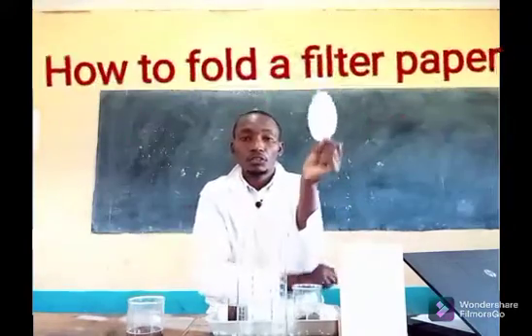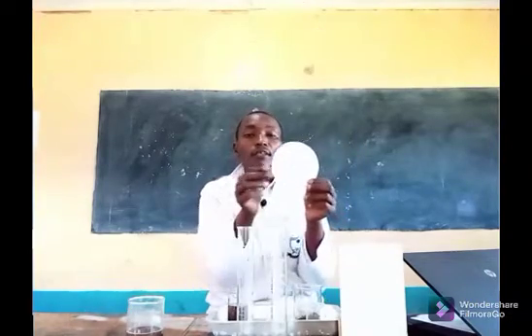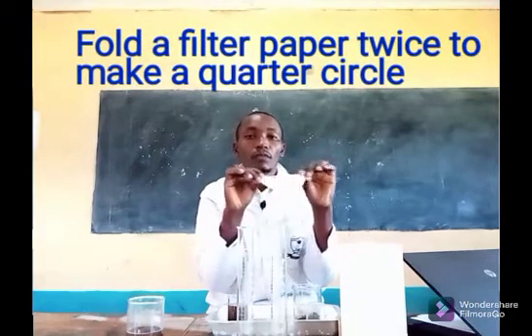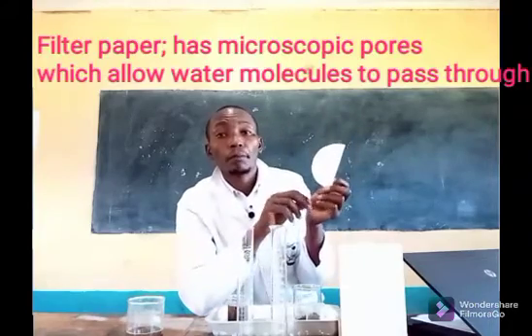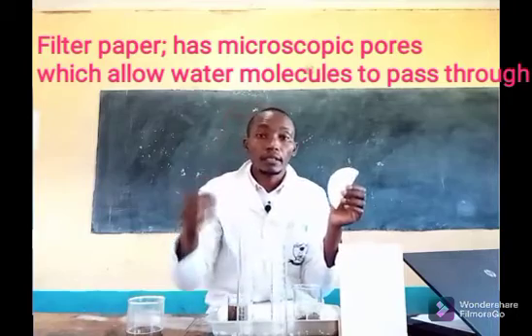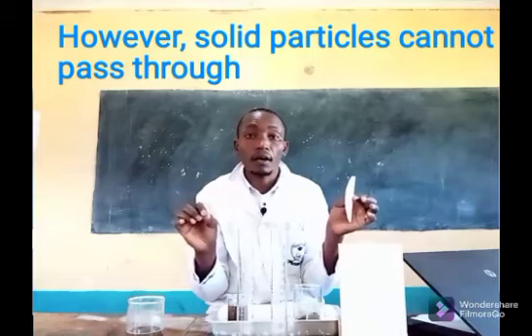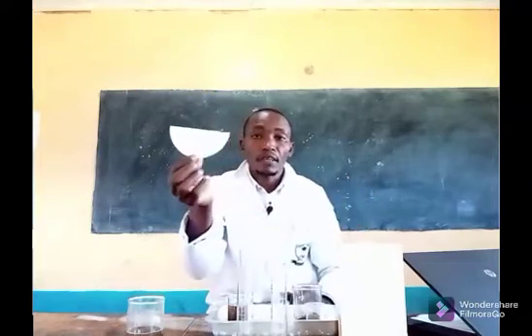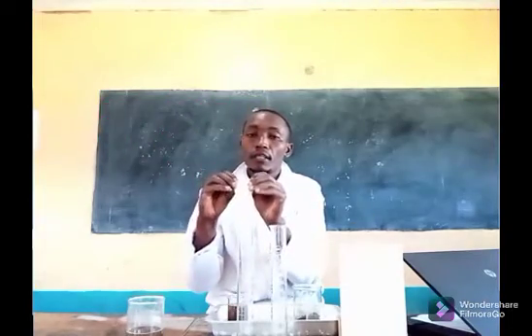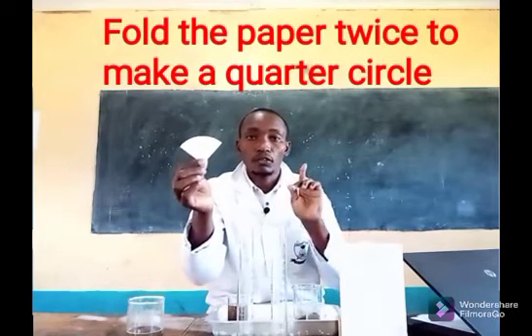One concept you should know: how do I fold a filter paper when I'm using a filter funnel? So the first step, you fold it twice. Remember, a filter paper is a special paper with some microscopic pores that will allow the liquid to pass through, but the solid particles, however small they are, cannot pass through. So I have the first folding, then I do the second. Carefully I do the second one. So that is a filter paper folded twice.